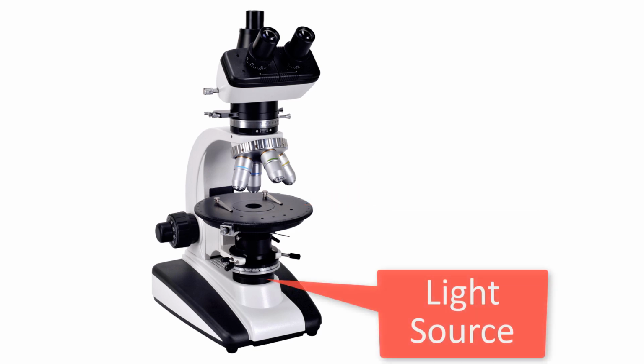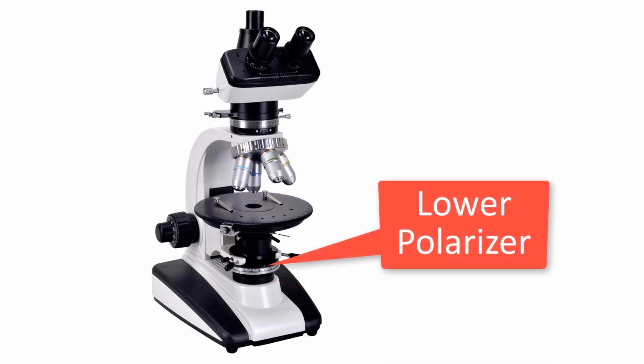A light bulb beneath the stage emits unpolarized white light, the wavelengths of which vibrate in many directions. This light then passes through the microscope's lower polarizer. The lower polarizer filters the light, constraining it to vibrate only within a single plane.